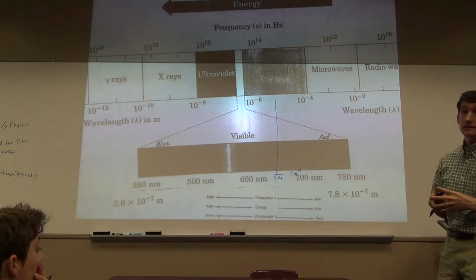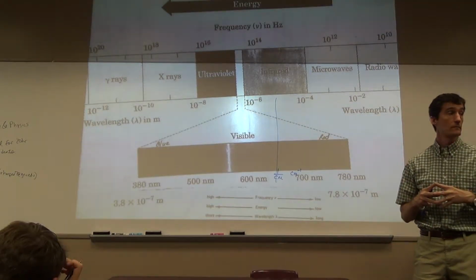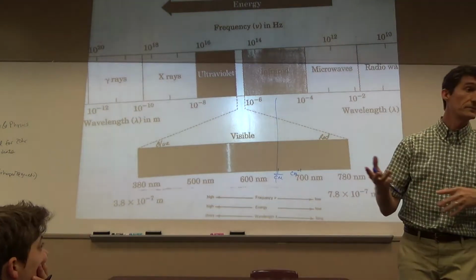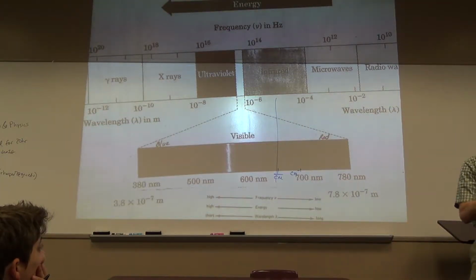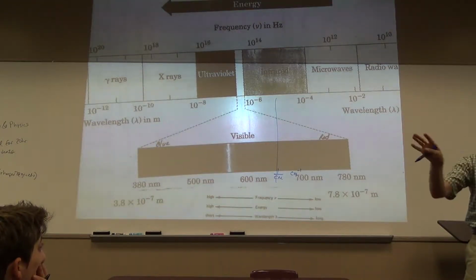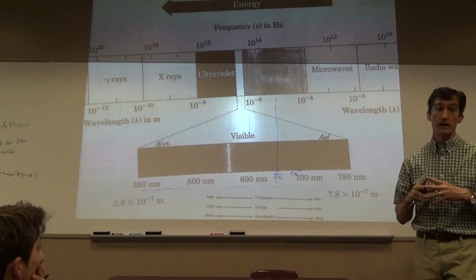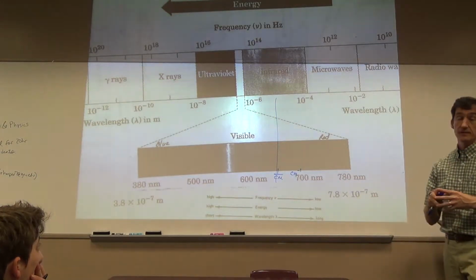In terms of chemistry, what information do we get from X-rays? X-ray crystallography. Of course, there's imaging, but more chemistry related. In X-ray crystallography, a molecule will diffract the X-rays as the light moves through the crystal, and the diffraction pattern can be interpreted to give a structure. It's the closest we can come to seeing the molecule. It's very amazing how that can give a structure.